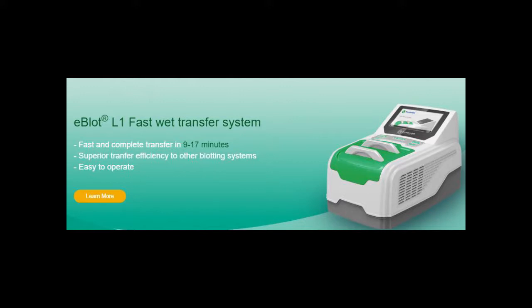Introducing EBLOT L1, the most efficient fast wet transfer system by GenScript.